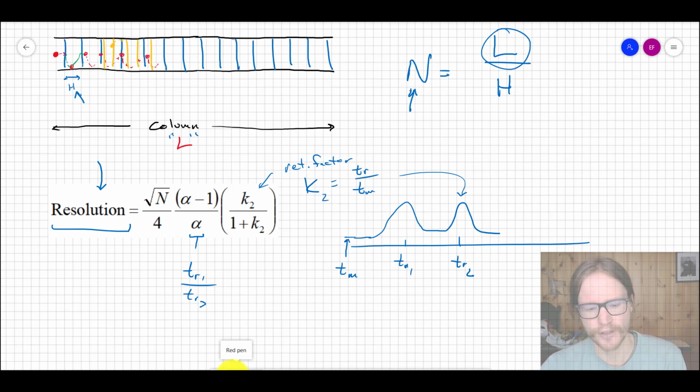Maybe you've got two peaks and they look more like this. You see this and you're like, that's not good enough for me to develop a method to quantitate whatever this compound is. Say you're developing your own method of analysis, which is what analytical chemists do, especially in terms of a wet chemical analysis. So you're saying, okay, I'm developing this technique.